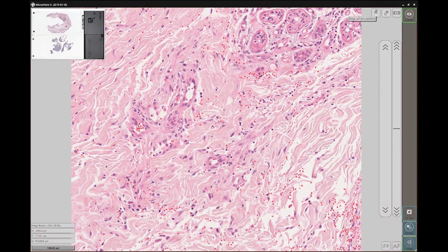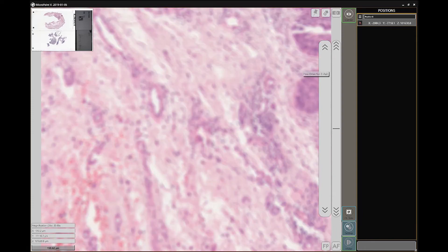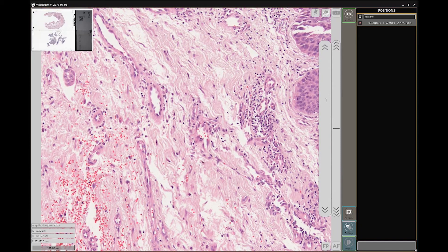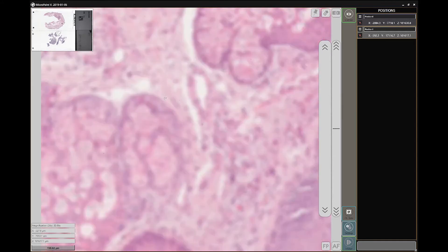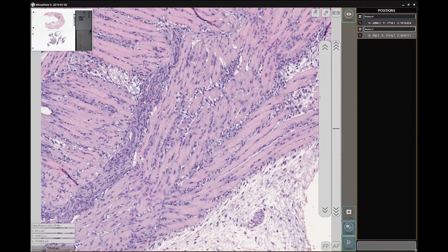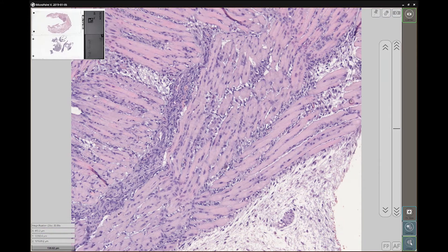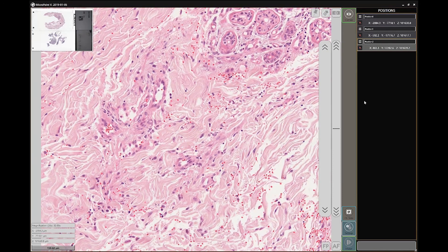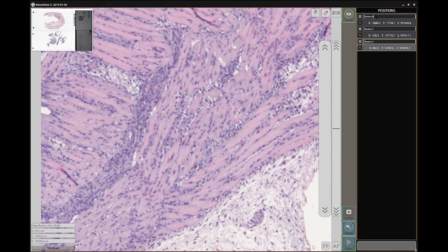This pin icon saves a specific field of view. It saves the exact X, Y, and Z position where the sample was at the time it was pinned. To do so, all you must do is be in the position you want to pin the location and click on the Pin Position button. Let's pin other areas so you can understand how it works. To navigate the pinned area, go to the info bar and click the position button. This is nice because it allows you to move throughout the sample in live view mode and revert to a location on the sample with ease.